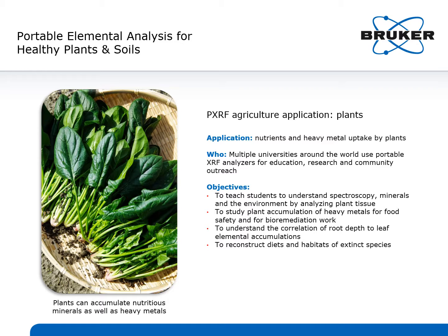Another university is using portable XRF to reconstruct the diets and habitats of extinct species. They do this by comparing patterns and data from known modern habitats to similar data preserved in the fossil record. They are quantifying variations in strontium to calcium ratios in fruits and leaves, as well as in teeth and bones to base the reconstruction on.